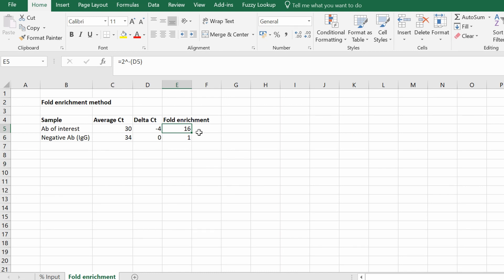In this video tutorial I've shown you two methods — the percentage of input and the fold enrichment method — to use during ChIP qPCR data analysis.